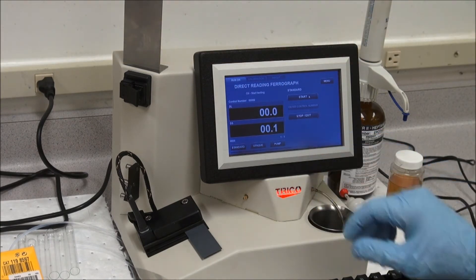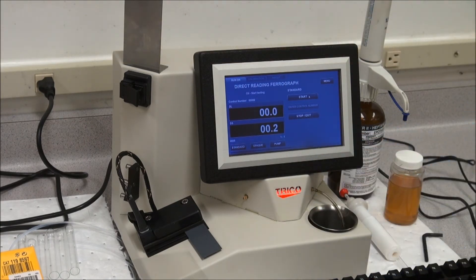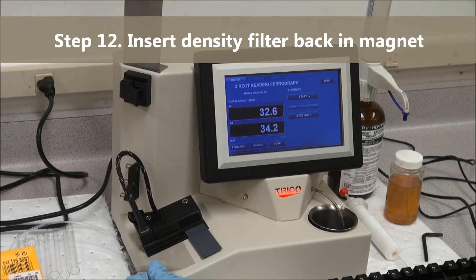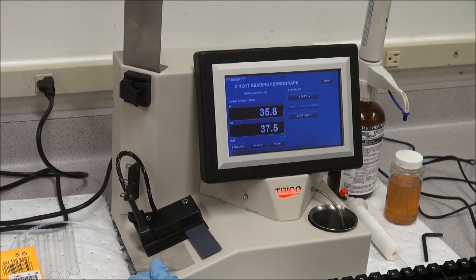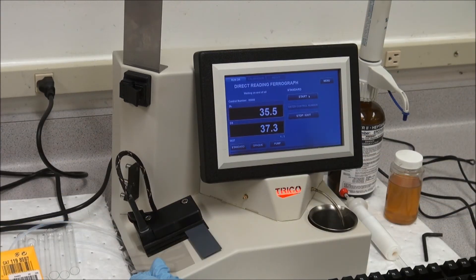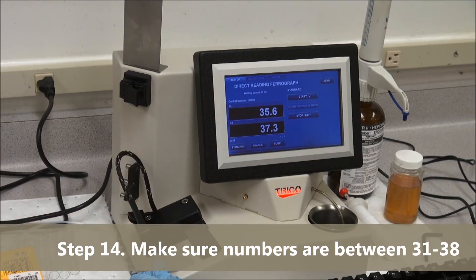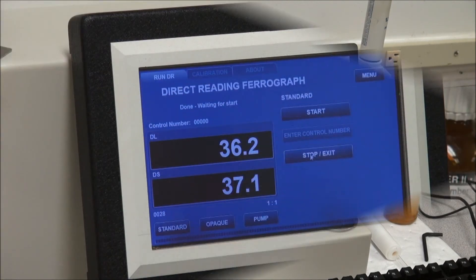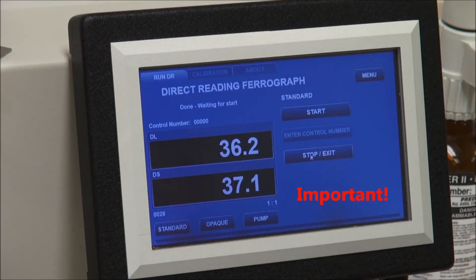Put the 0.1 density filter inside the block and pull it out immediately. The numbers will move up and down briefly, indicating that the oil is there. It will say waiting on an end of oil in the center of the screen. Insert the 0.1 density filter back into the block. Once the numbers have leveled out, these are your numbers — record them as necessary. Assure that they fall between the 31 and 38 range stated in the instruction manual. If they do not fall within this range, the magnetic block needs to be readjusted and the calibration needs to be redone.